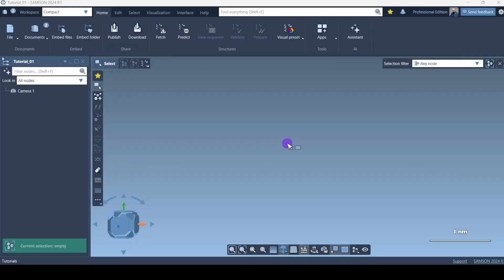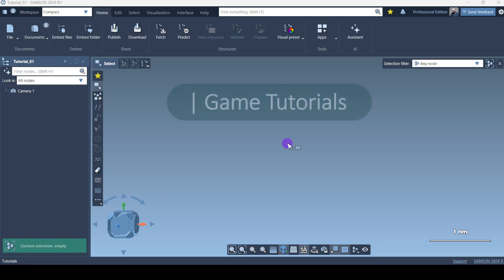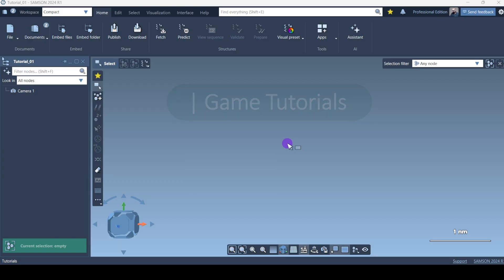Hello everyone, welcome to another video. In this video I'll try to show you how gaming tutorials work in SAMSON. We'll be starting step by step on various gaming tutorials that are available. They are very easy — you can simply click on all those things and learn by yourself, but if for some reason you are stuck, I'll show you and you can watch this video.